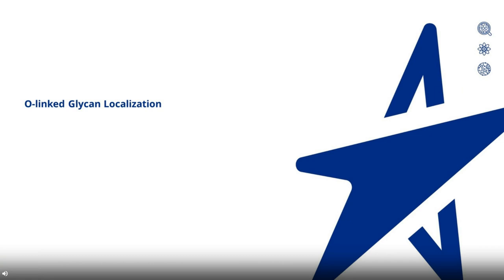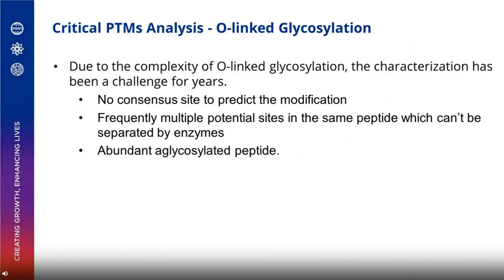As mentioned earlier, the Etanercept TNFR region contains up to 13 O-linked glycosylation sites. In contrast to N-linked glycans, O-glycans don't have a single consensus sequence for potential glycosylation sites and also have no known structures for prediction of the glycan structures. So it is more heterogeneous and often clustered together, most of the time in high density, particularly in serine and threonine clusters. And also O-linked glycosylation sites are often labile and complex.